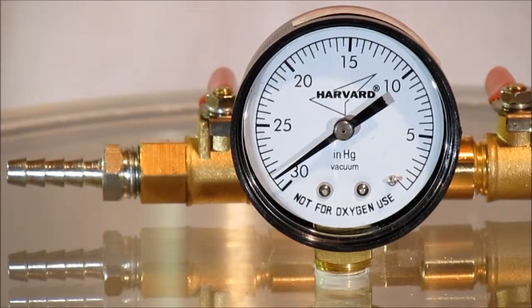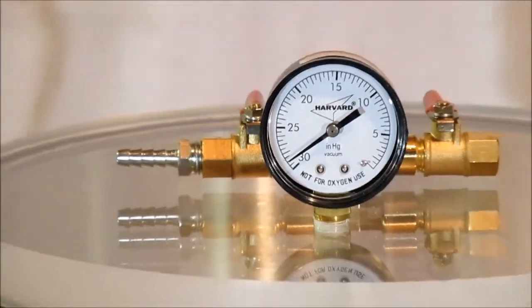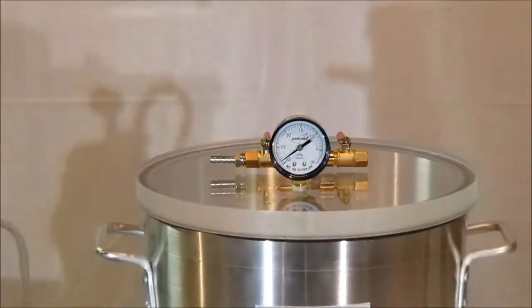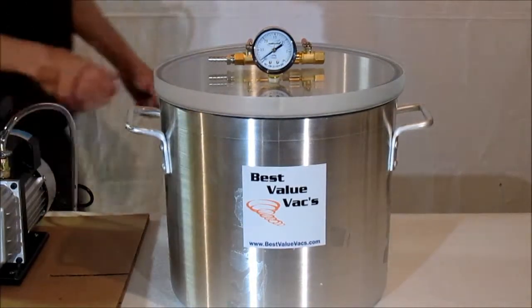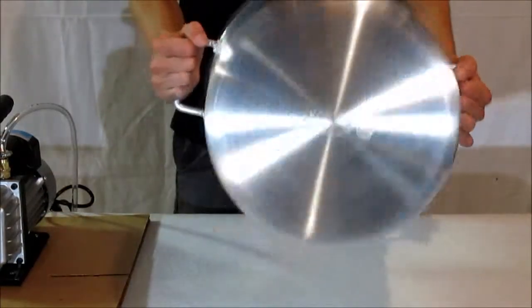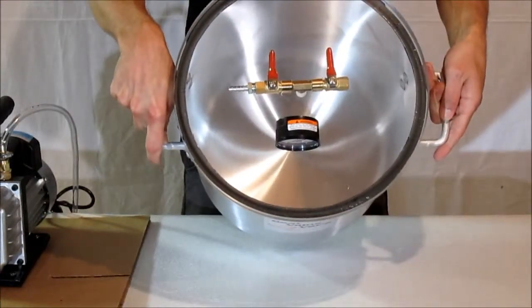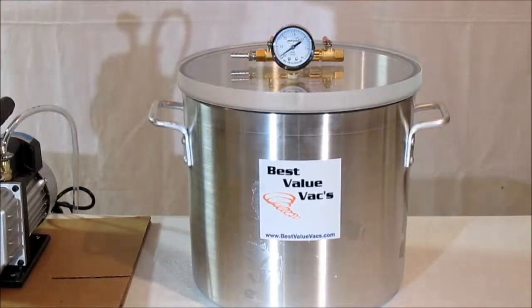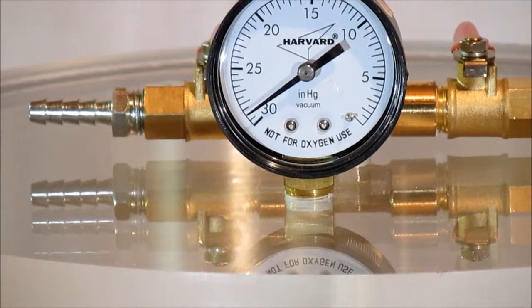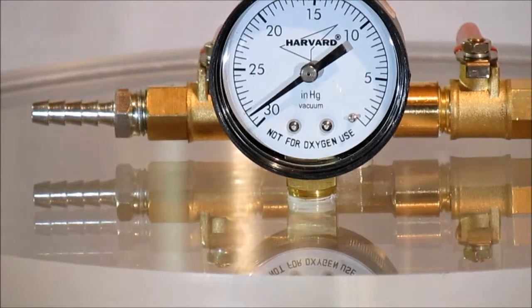Notice that the chamber is maintaining its vacuum. The chamber is not dented or imploded in any way and the lid is not cracked. Still maintaining your vacuum.